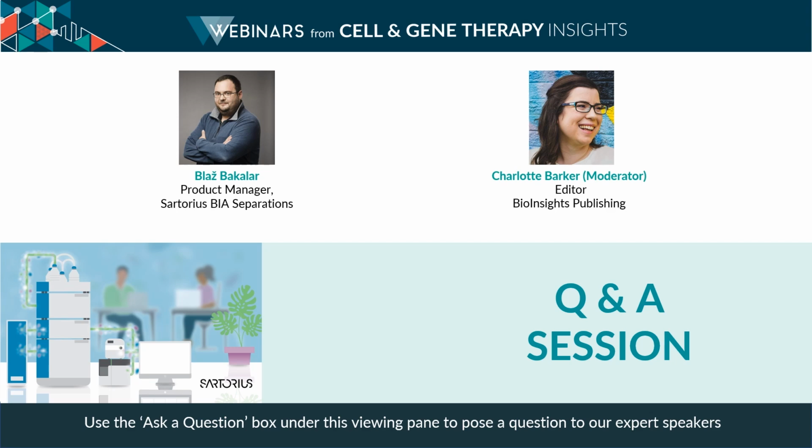He says, is it necessary to use a second C4 HLD column if we're not linearizing DNA? That's a question of preference. So the C4 column that we use in our production process, or recommended production process, I would say, because for everybody it can be a little bit different, is to enrich the supercoiled isoform, for instance, from the open circular isoform. So it might not be strictly necessary, but it is important that you're very sure that you've removed residual RNA, for instance, before utilizing it for a reaction like IVT.